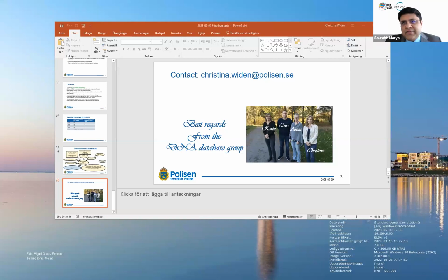From reference samples? That's right, reference sample. The reference samples are always from one person, of course, and no mixture, but we have actually entered some profiles in our system. I think there are about 18, 20 multi-allelic offenders. So we see that as well, and we have entered them into our database.